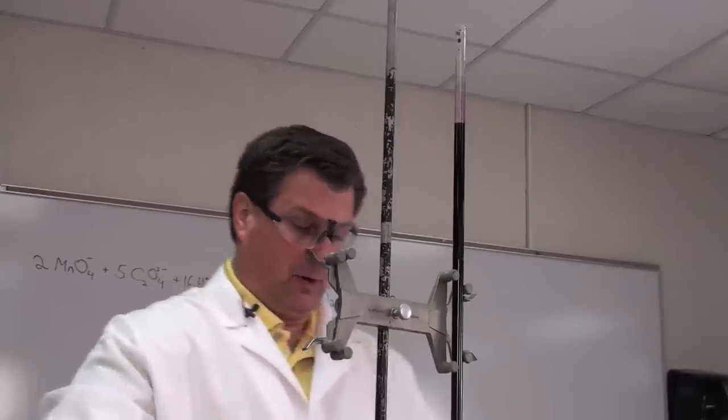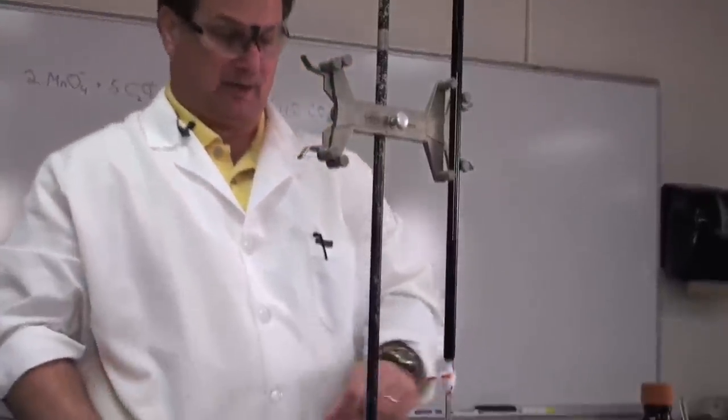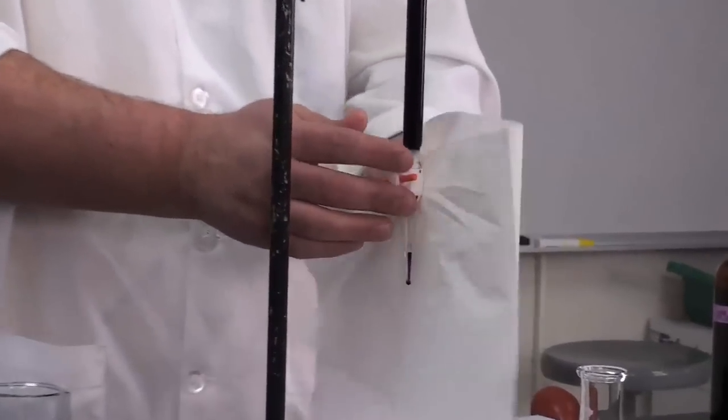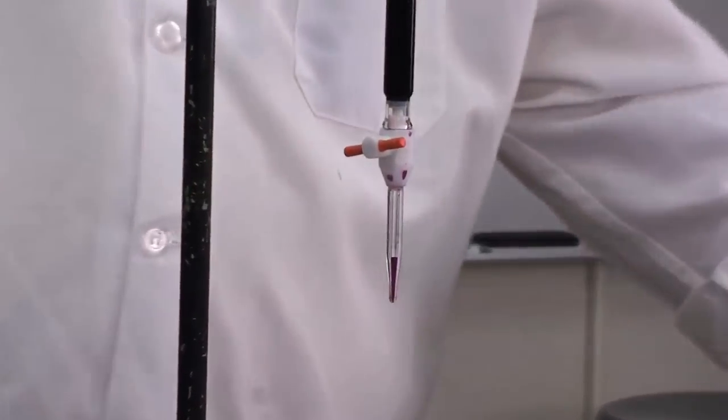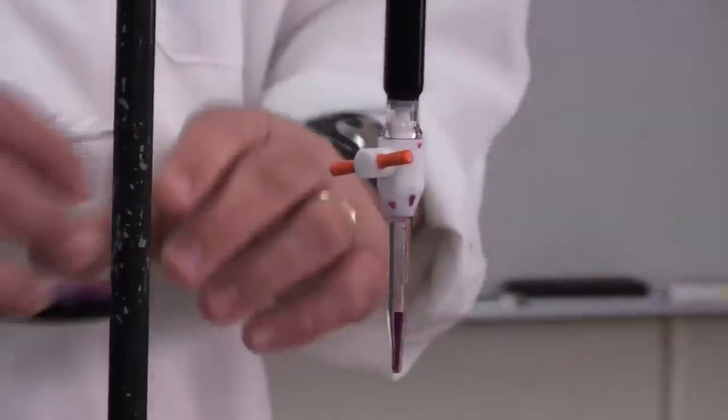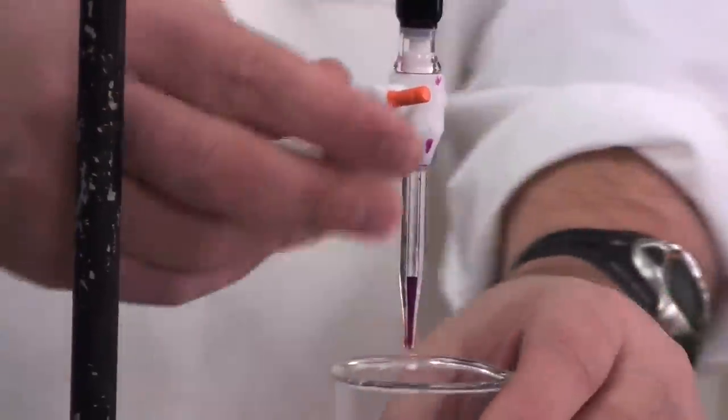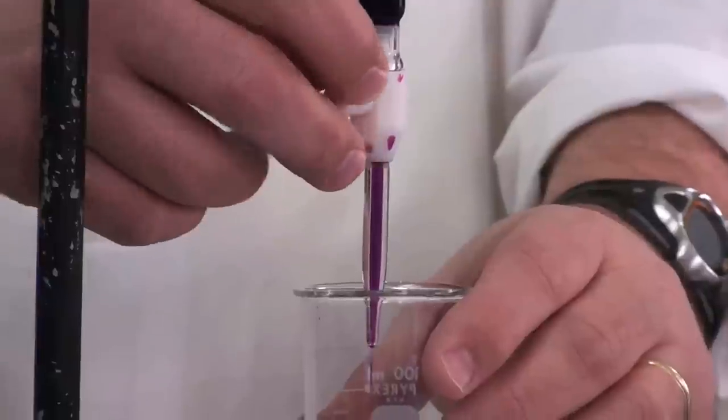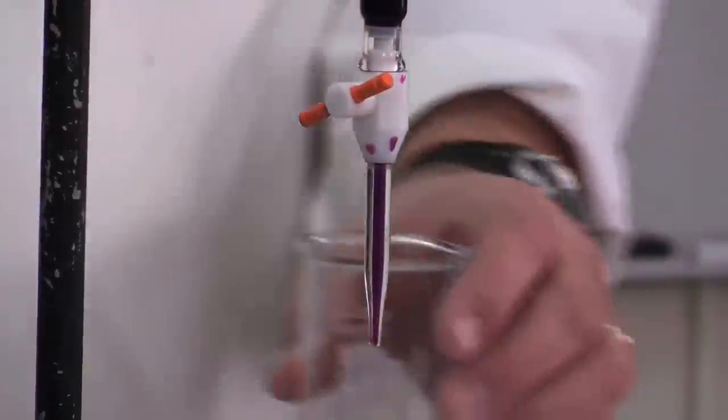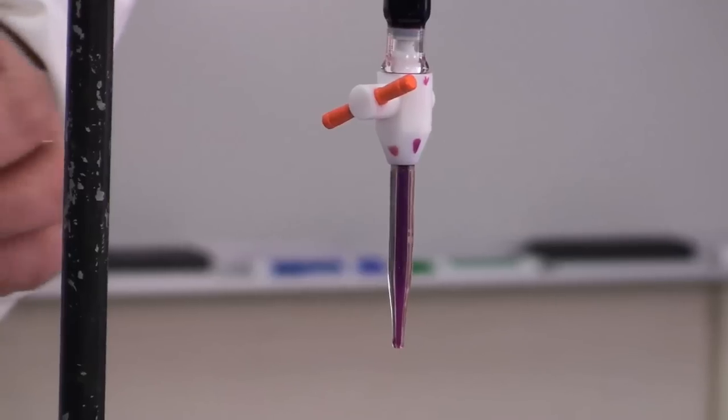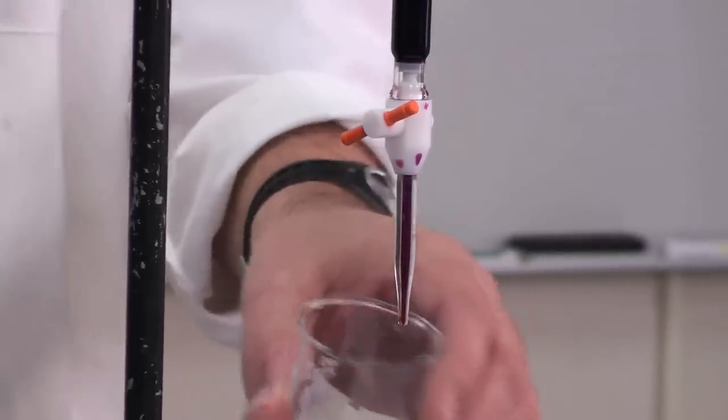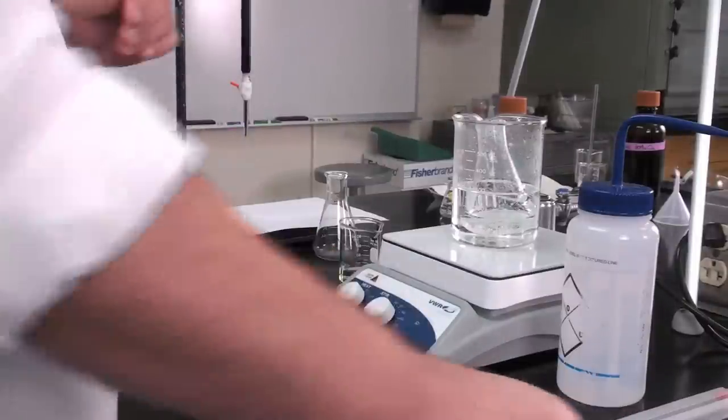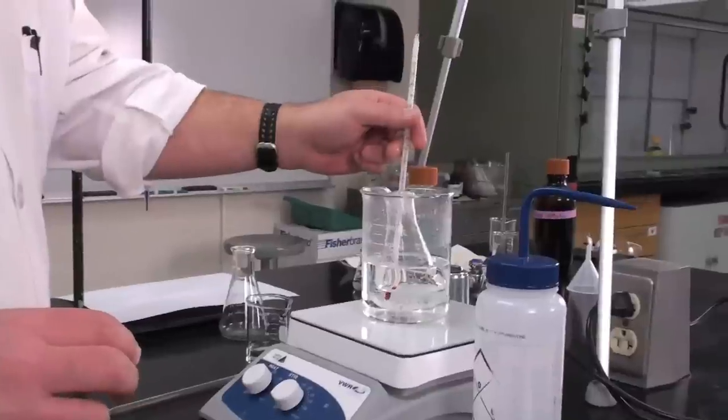Now the other thing we want to do—notice the tip down here has air bubbles in it. We want to make sure we get all of that out. That can change or alter our volumes in an irregular way. The easiest way to get that out is to put a waste beaker underneath and let some liquid flow until the bubble is gone. You want to make sure all the air bubble is gone from the tip of your burette. Let's check our temperature and see if our solution is ready to go.